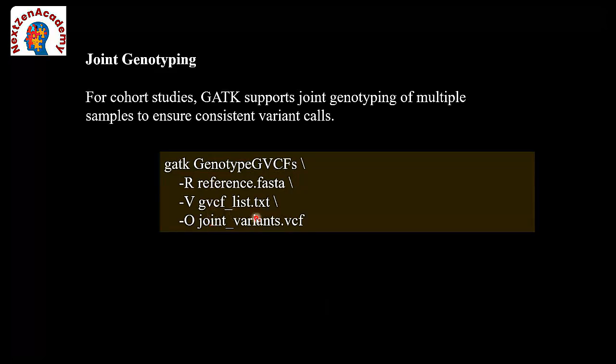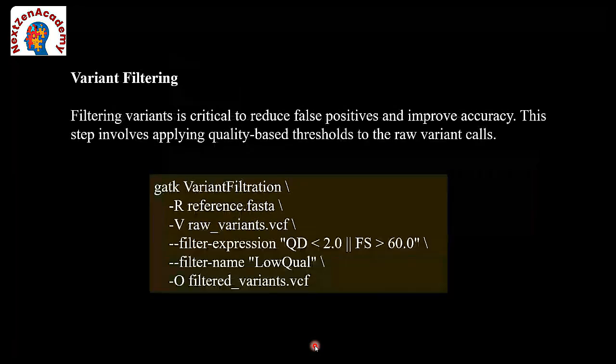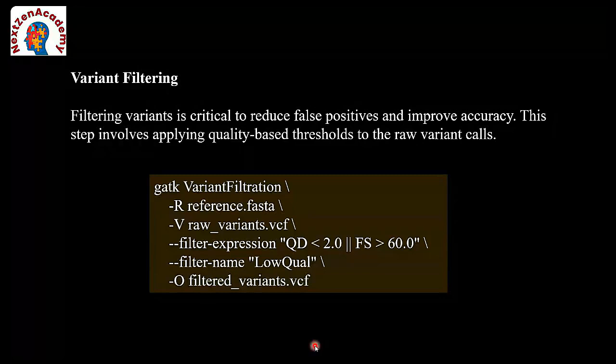Once this is all done, we need to call the variants. That can be done with a command called HaplotypeCaller. The haplotype-based calling method is helpful to identify the haplotypes from reads, and the output can be in GVCF format for doing joint calling.